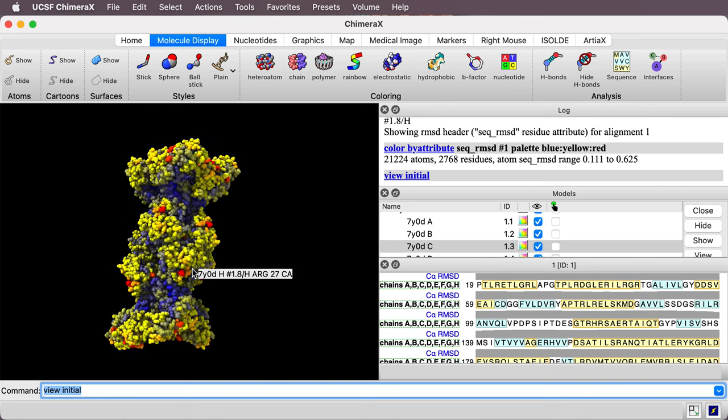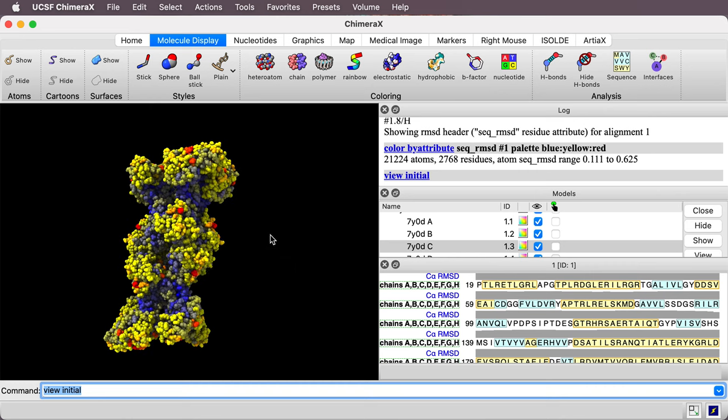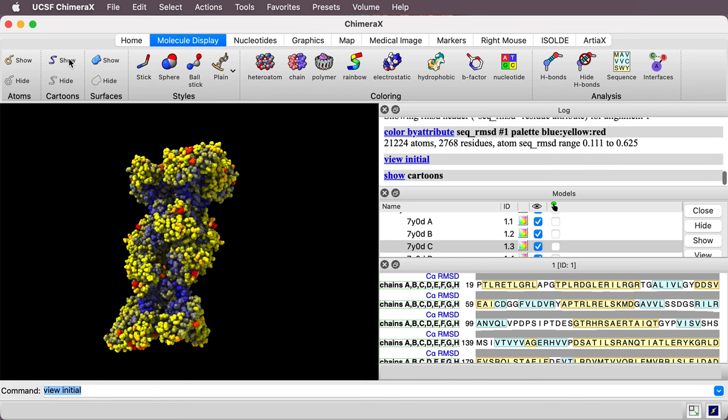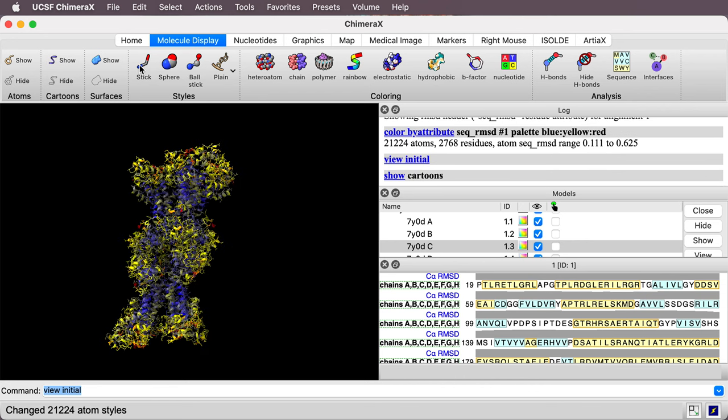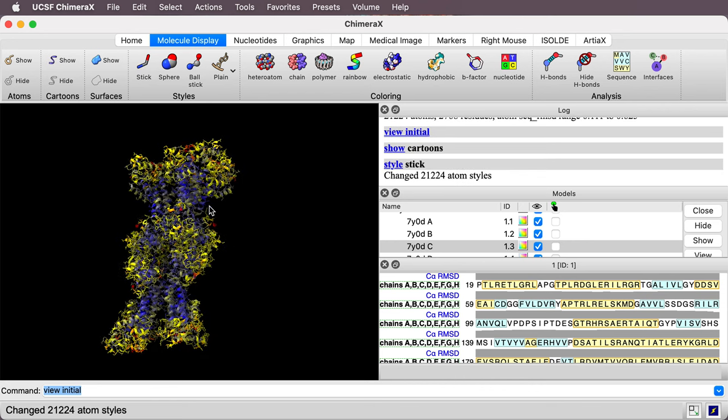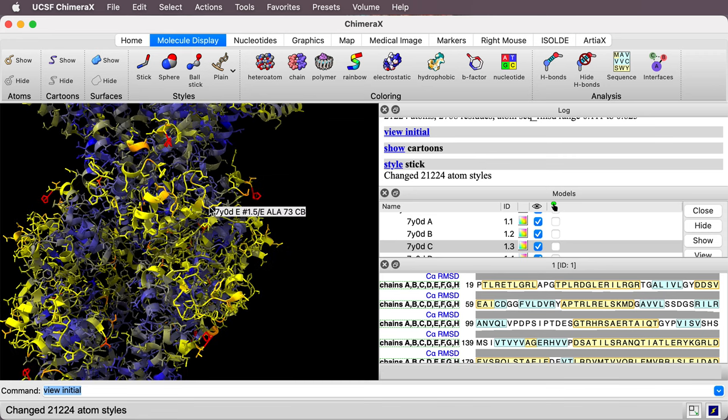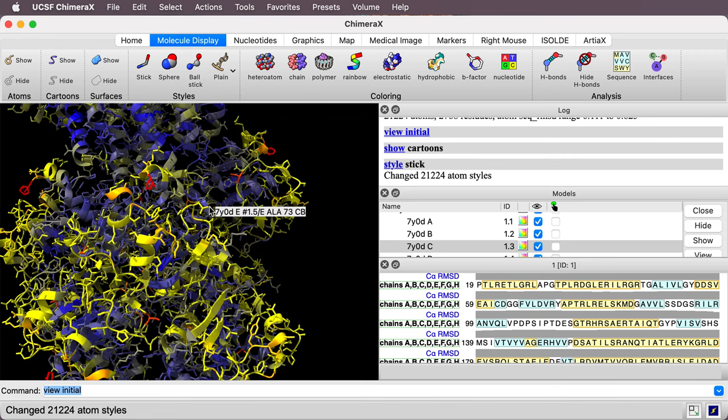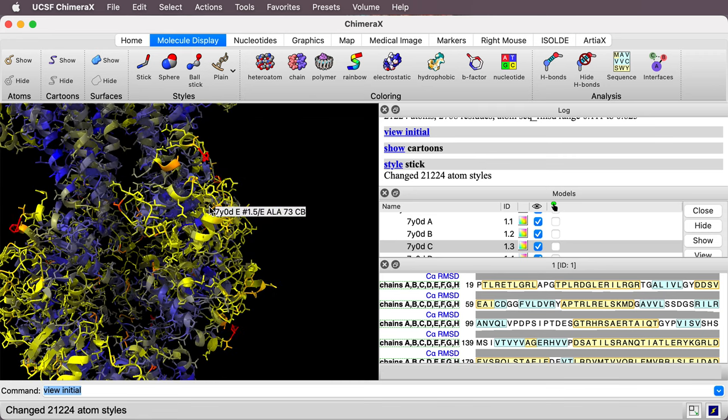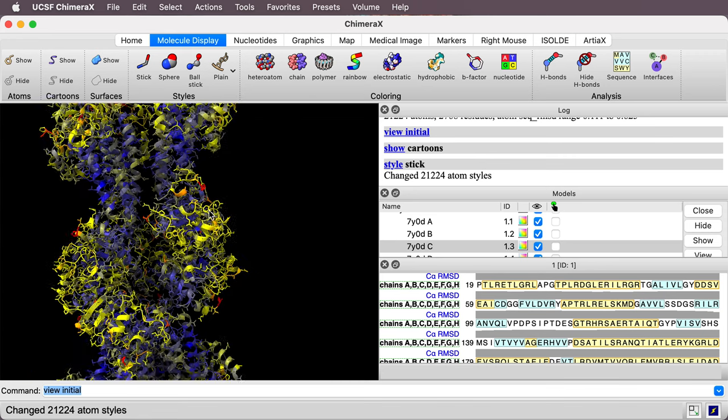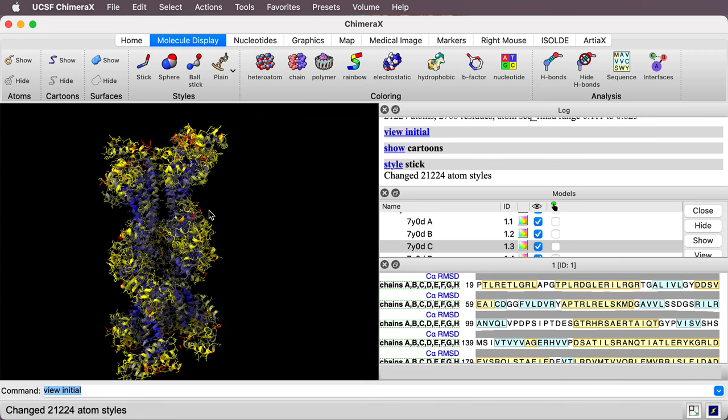We could also display this as a cartoon with side chains. Up in the toolbar here I can say show cartoon. I could change the side chains to stick style. I'll give a little bit different view. Thanks for listening.